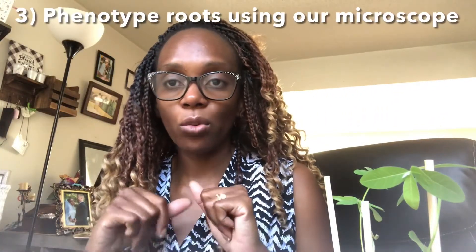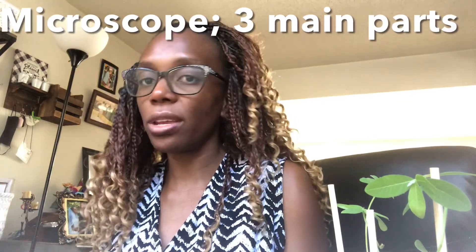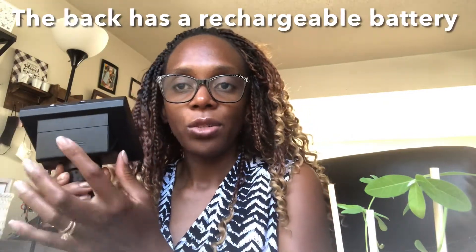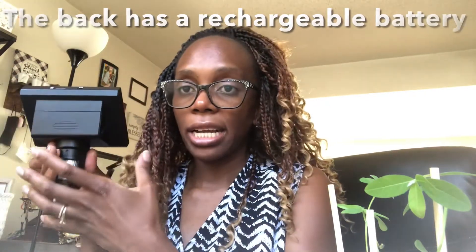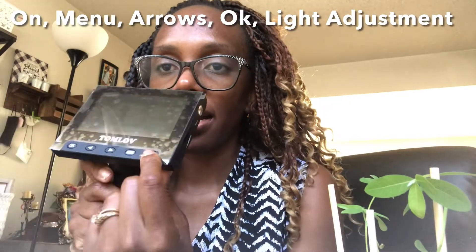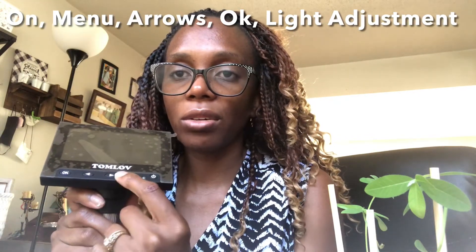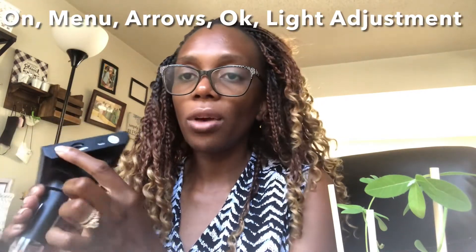The third thing is phenotyping our roots, which I'll show now. Let's talk about our digital microscope. When you open it, it comes in three main parts. The top part has the LCD screen and a back section with a rechargeable battery. As long as you connect the microscope setup to a computer it charges, so they advise charging it the first time by connecting the USB to your computer. The top part also has a power button, a menu button, and you scroll up, down, or side to side using two controls, with an OK button to confirm selections.